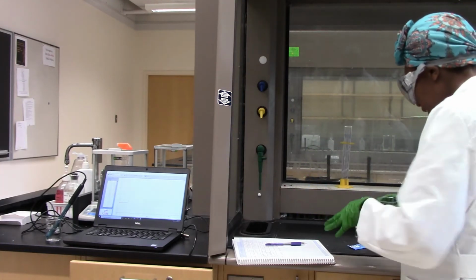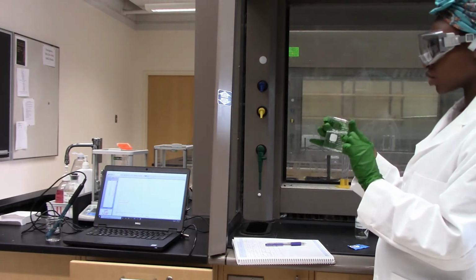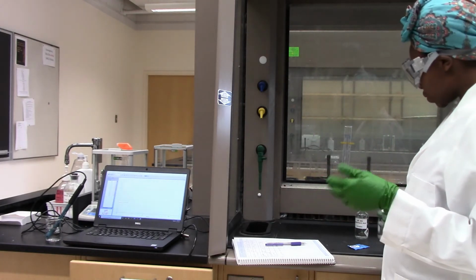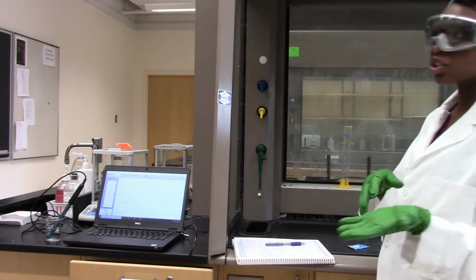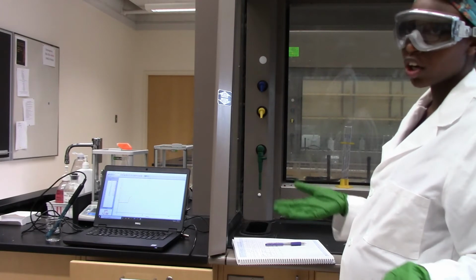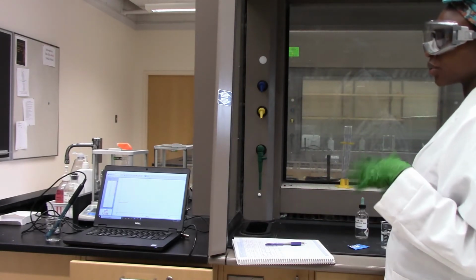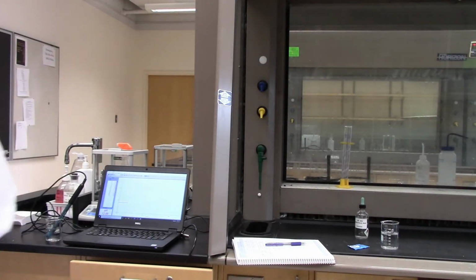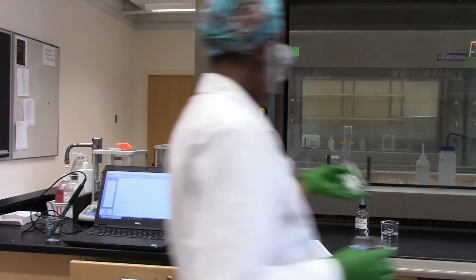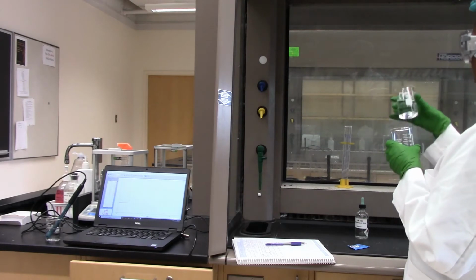And after making this solution, this is 100 milliliters of water, so I'm dividing it in 2 to get 50 and then do the pH measurements with addition of hydrochloric acid, and then I'll do the other 50 with addition of the sodium hydroxide. So, let's go with that, half and half. This is about 100.